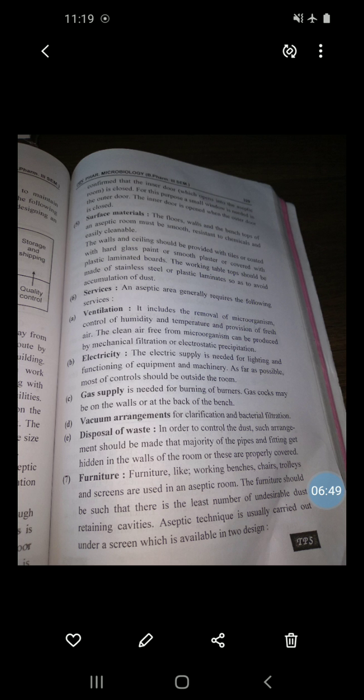Then surface materials. The floors, walls and bench tops of an aseptic room should be smooth, resistant to chemicals, and easily cleanable.